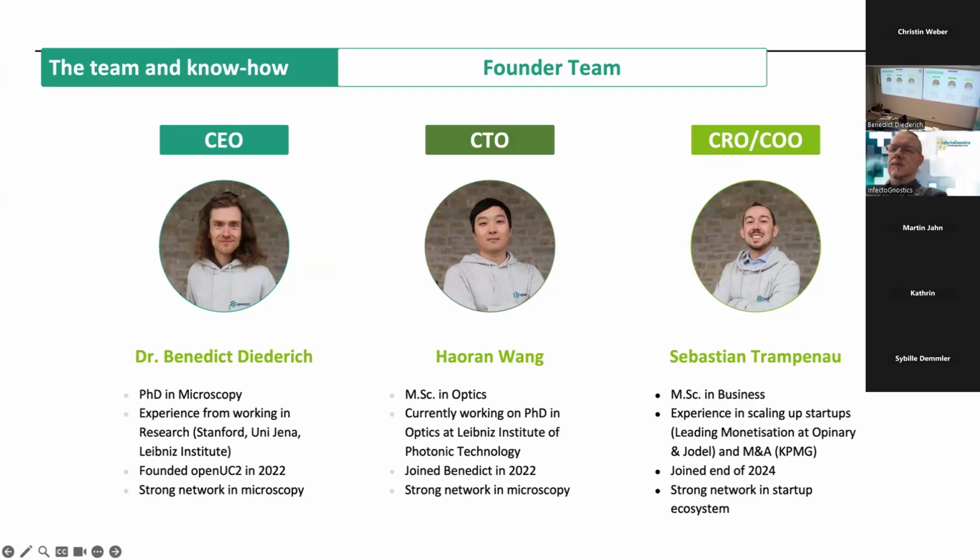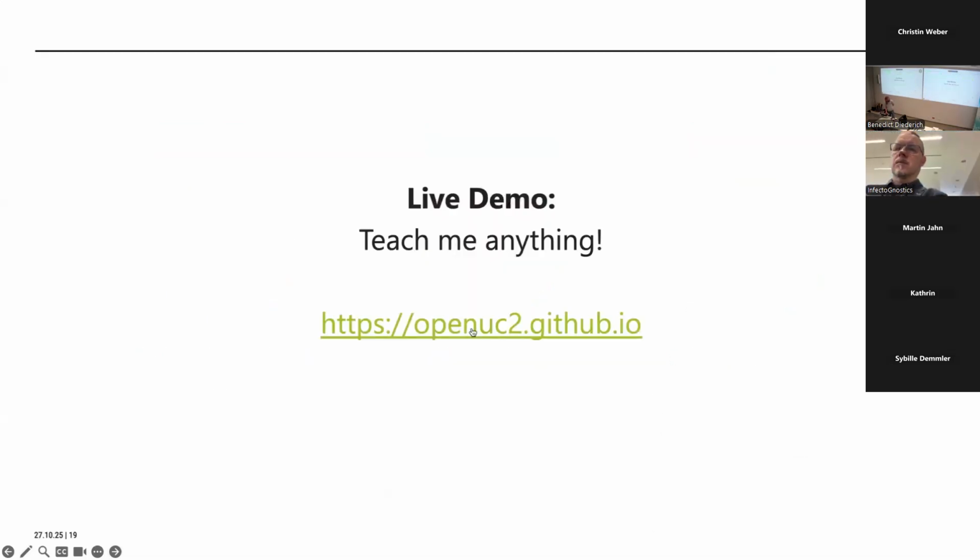So the boxes are the first product that is scaled by means of above 100. And so we're collaborating with some people from a workshop for people with disabilities. And they actually have very much fun assembling these devices, which is also a very nice thing for us to see, appreciated not only during the experimentation, but also during the assembly. And if you follow this link, the QR code that is on there, you will probably go here.